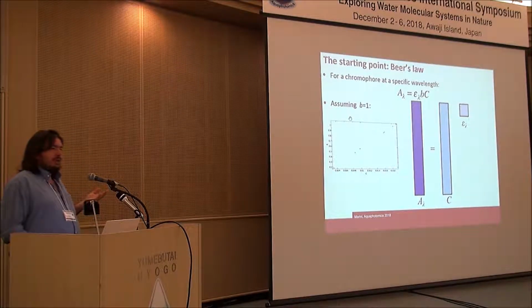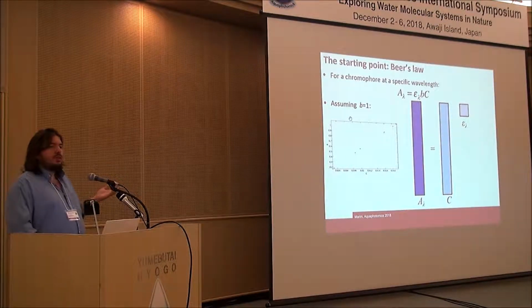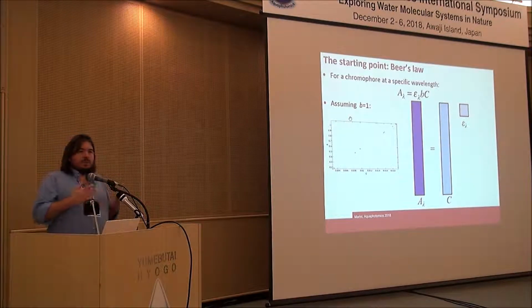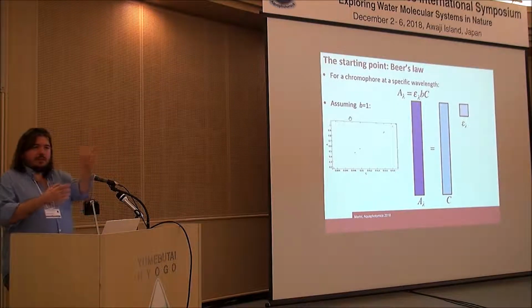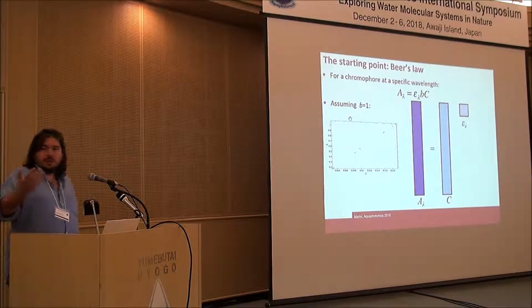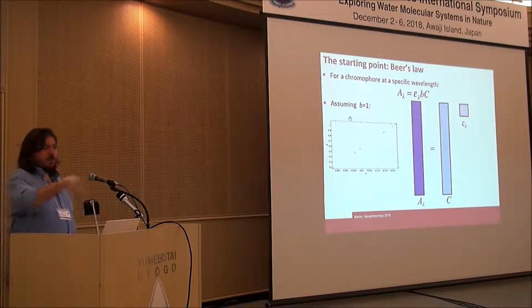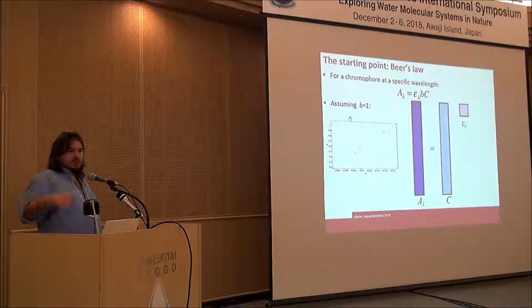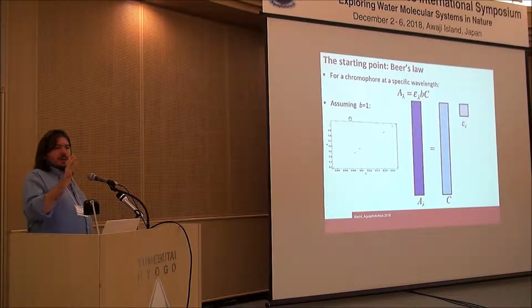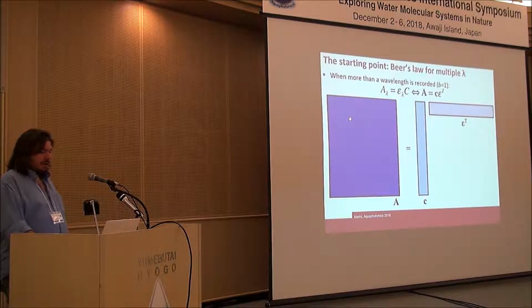So we do the same decomposition, but then we aim at having something that more closely resembles standard Beer's law, where we can interpret directly the scores as relative concentration and the loadings as normalized spectral intensity, or let's say extinction coefficient patterns, extinction profiles for the different substances. So we look directly into the chemistry of the data.